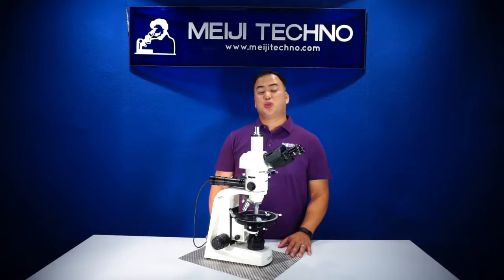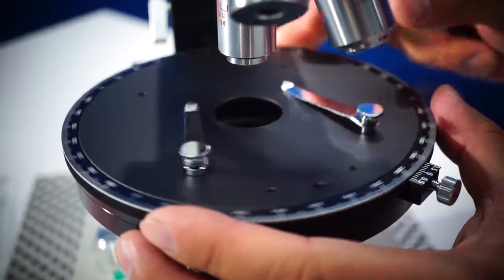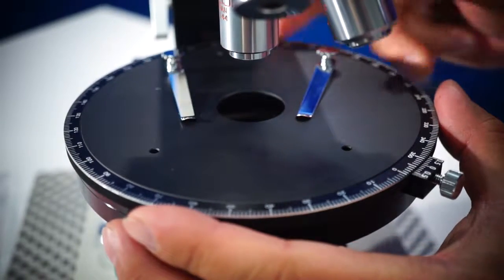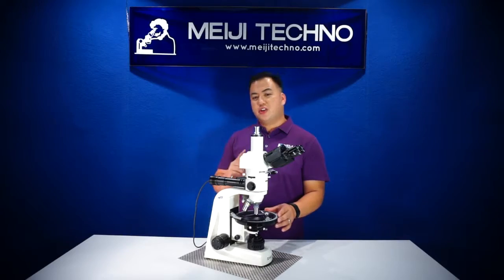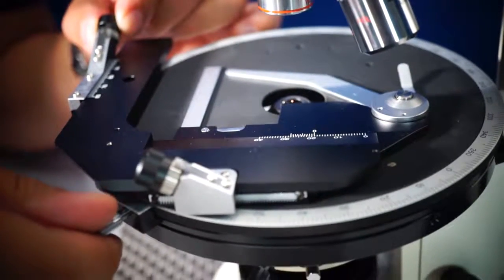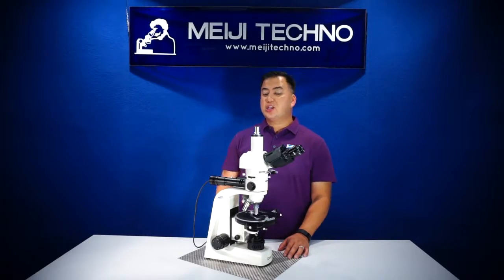The MT9900 comes with a ceramic-coated 175-millimeter diameter ball-bearing rotating stage, graduated 360 degrees with 1-degree increments and Vernier readings to 0.1 degree, along with two stage clips. A point-counting optional mechanical stage is available, though mechanical and point-counting stages are available as an option.